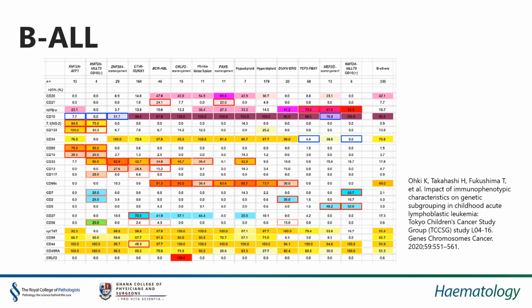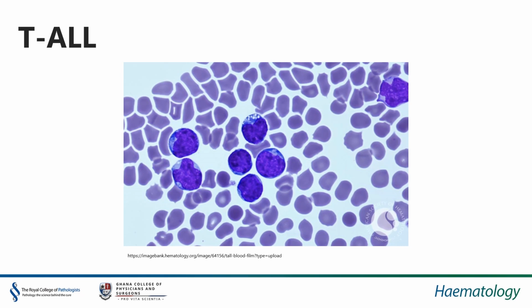Like B-cell acute lymphoblastic leukemia, T-cell ALL can also be quite challenging morphologically, as these cells here could easily do for, say, Burkitt or high-grade lymphoma. And I've seen cases of blastic plasmacytoid dendritic cell neoplasm look very much like T-cell ALL. So again, very challenging morphologically, which is why we need the additional investigations such as flow cytometry and genetics to actually define what these cells are. This is a little bit more classical, what we can see in T-cell acute lymphoblastic leukemia.